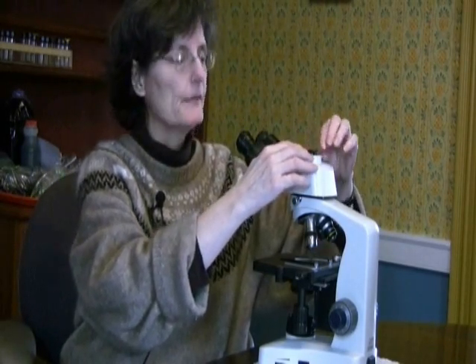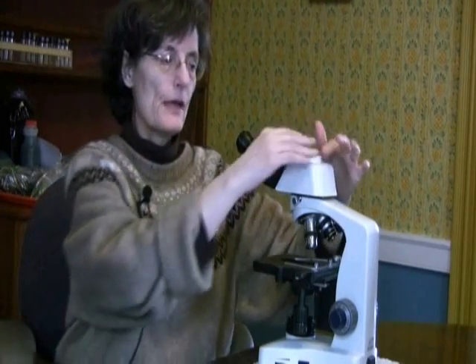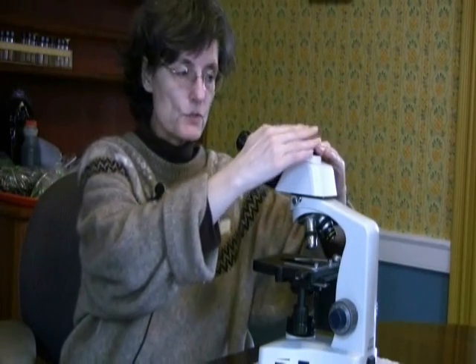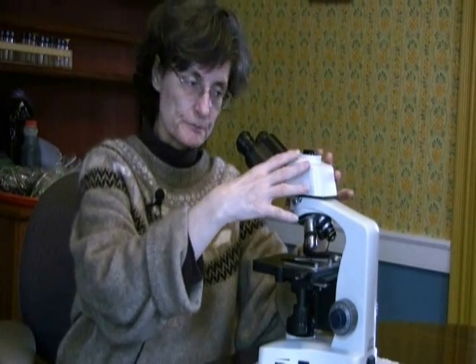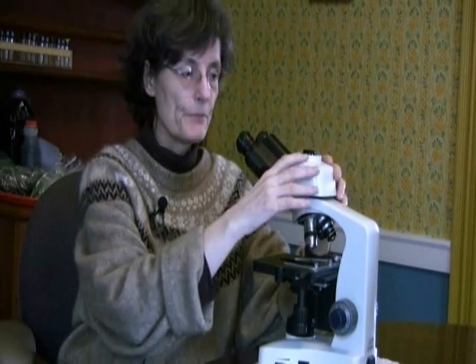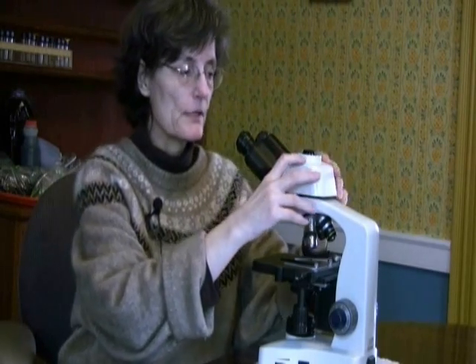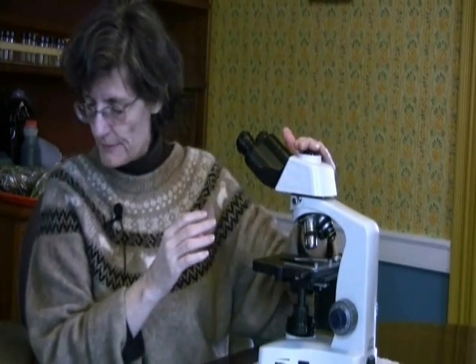You have a trinocular head here, and so that needs to be covered. Don't lose this tape. Put it on something so that when you put this head back into the microscope carrying case, you cover and protect the inside of your microscope. Dust and dirt down in here, you can't clean it. You've got to get a professional, because all of these inner surfaces of the lenses inside the microscope have special coatings to try to prevent dust and dirt from sticking to them. And if you start wiping on these things with a Q-tip or water or xylene or some cleaning agent, you destroy those protective coverings on those lenses. So let a professional work on the inside of the microscope. Make sure that cover's on there.